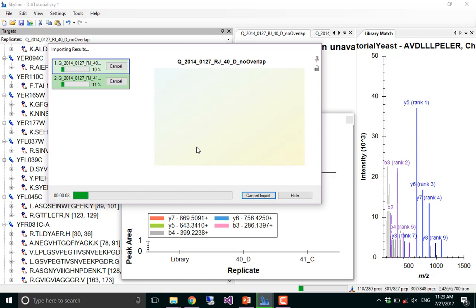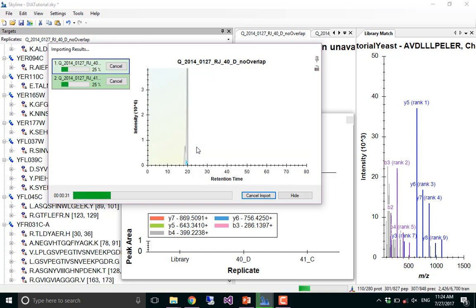There they go. Does anybody have any questions while the data imports? No, I did not. So in this particular example, I'm doing it without IRT. Usually you would want some sort of retention time calibration, particularly if the library data was acquired either from an aggregate of experiments or on a different column. This is just the very simplest case where actually I acquired the DDA data on the same LC column. So we're just using like a 2-minute alignment without IRT.